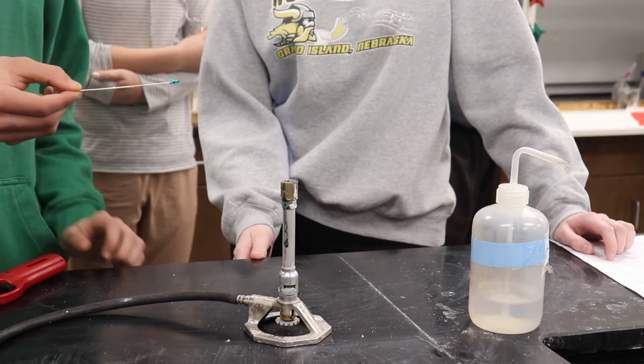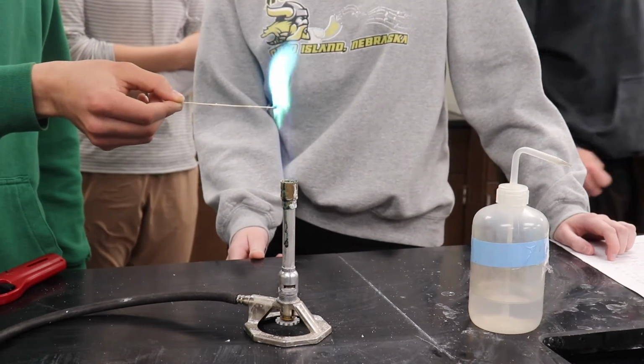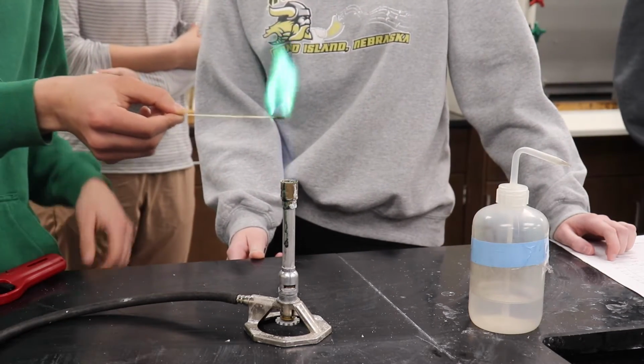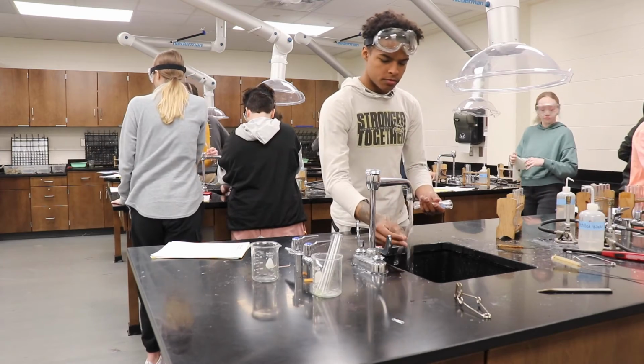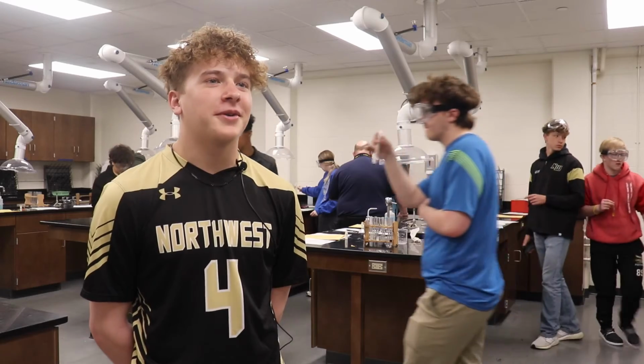For some of the anions, a lot of them have to make gases when you dissolve them with acids, and so there's a couple of other tests you can do to specifically identify through precipitates or through other types of acid-base reactions. Qualitative analysis challenges students to think hard to find their chemical.